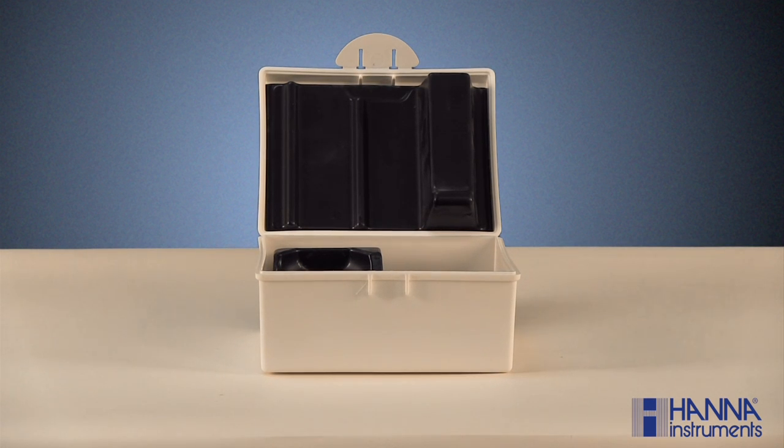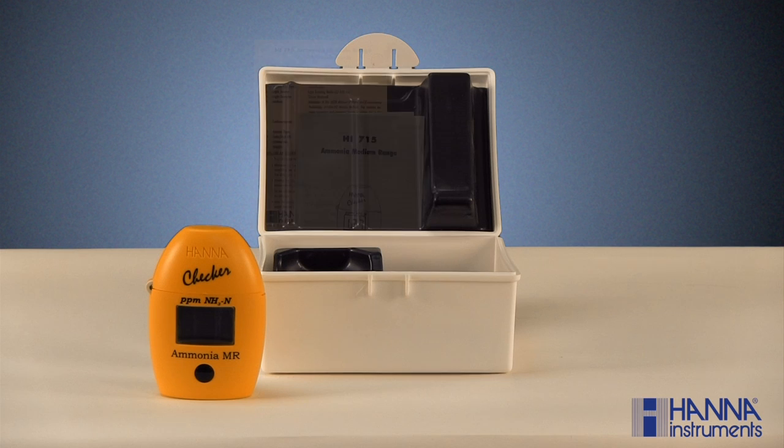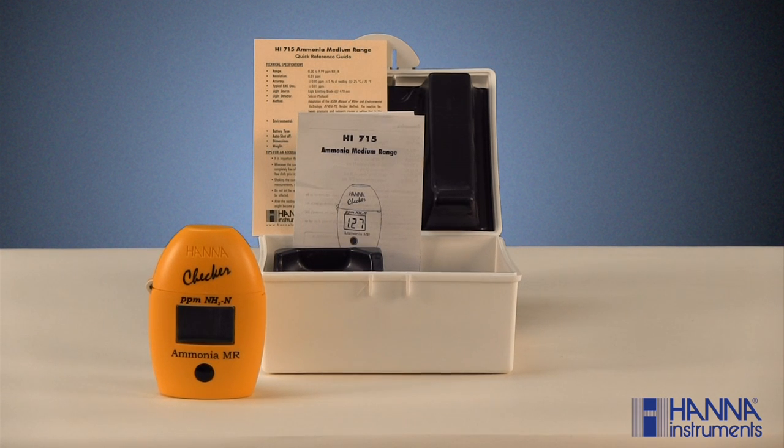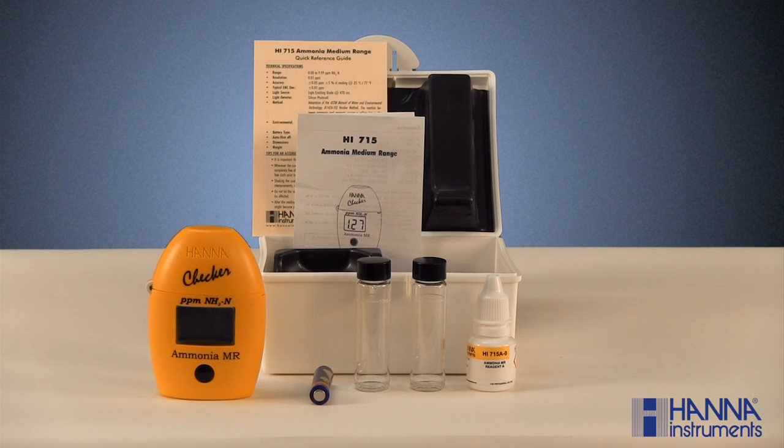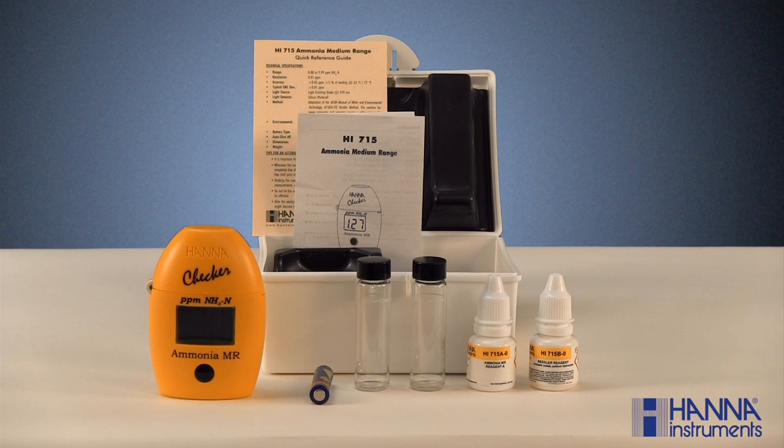With the HI-715 ammonia checker, you should have received a carrying case, the checker, an instruction manual and reference guide, one AAA battery, two 10 milliliter sample cuvettes with caps, a bottle of HI-715A-0 ammonia reagent, and a bottle of HI-715B-0 ammonia reagent. If your kit is missing any of these items, please contact our customer service department.